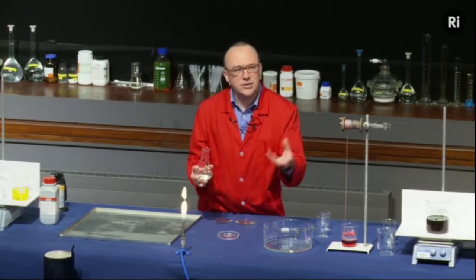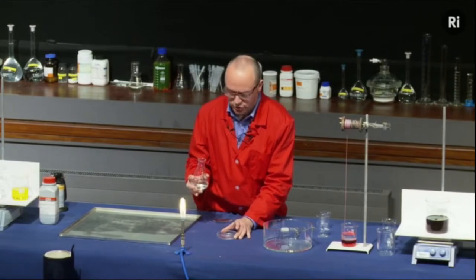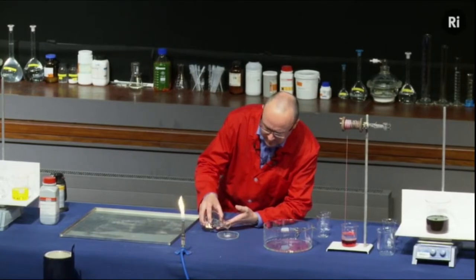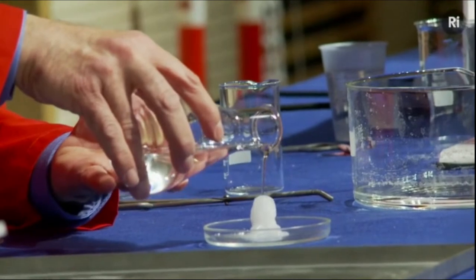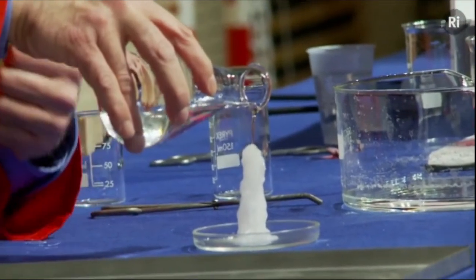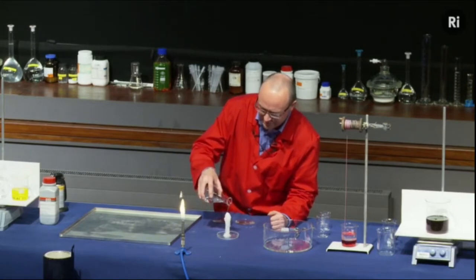It would like to turn into a crystal. But it needs a sort of an excuse to get going. And the excuse is going to be some little crystals of solid sodium acetate in this dish. So watch what happens as I pour the liquid onto the crystals. I think you can see there, the liquid, as soon as it touches the crystals, is turning into a solid. And with a bit of luck, we can make a sort of chemical sculpture.